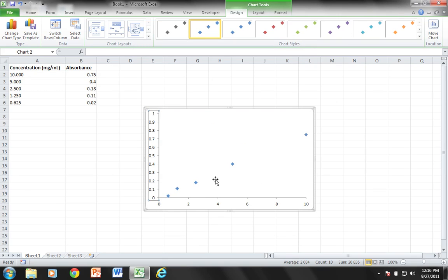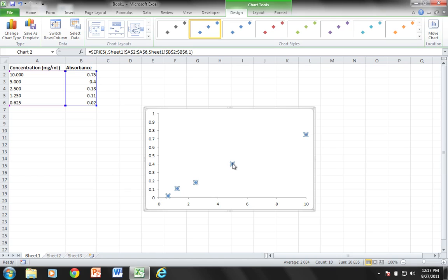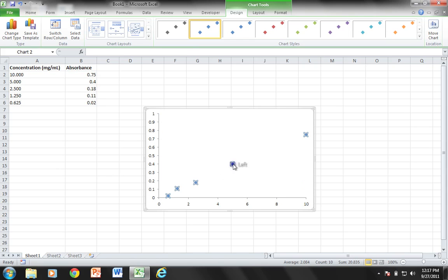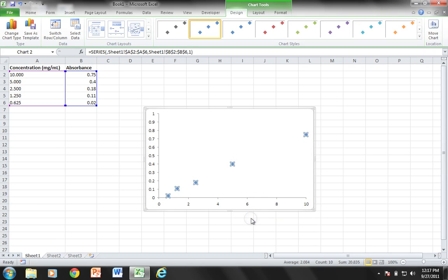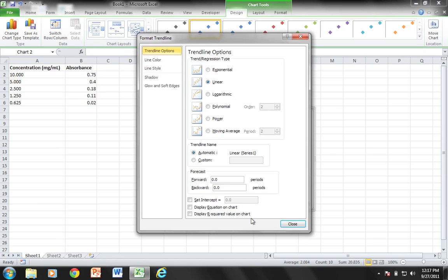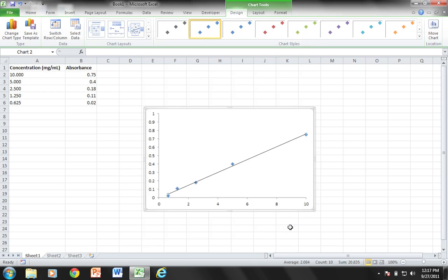Now what I want to do is add my trendline, the line of best fit for my standard curve. I'm going to click on my data points, right click, and choose add trendline. I'm going to choose a linear trendline and close it up.